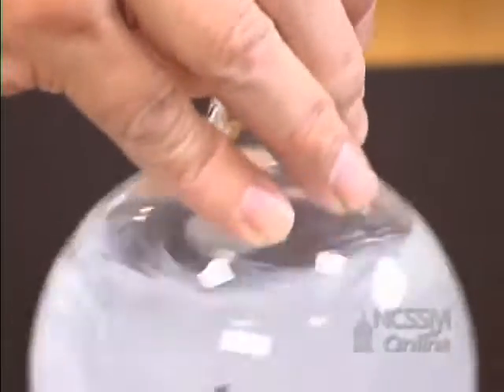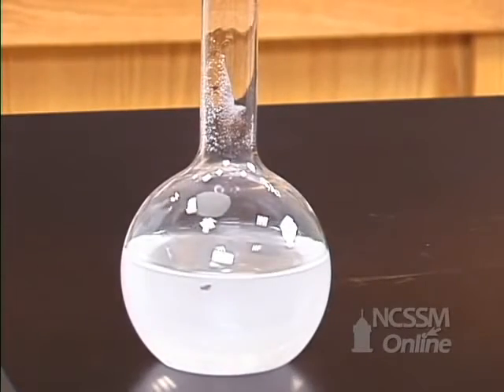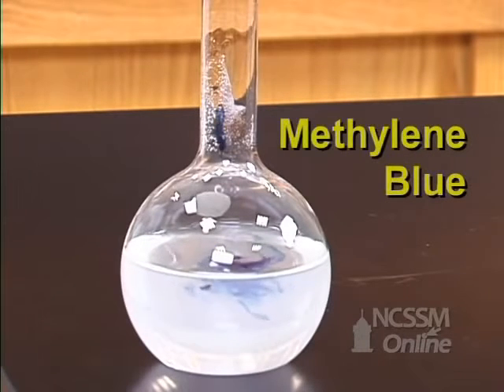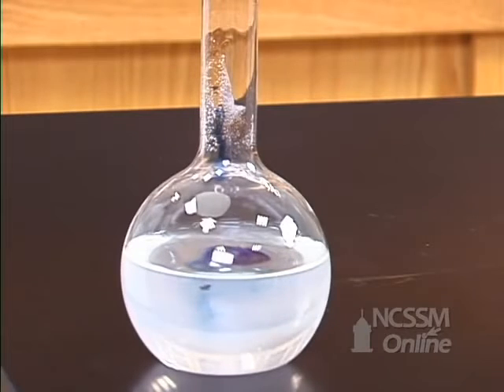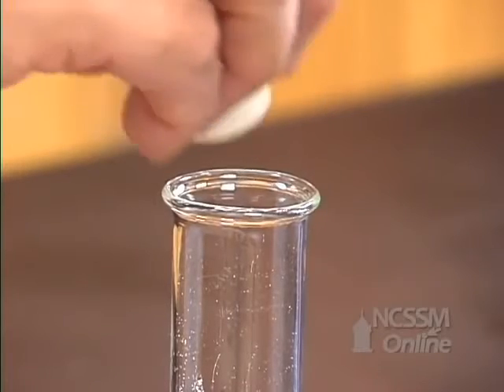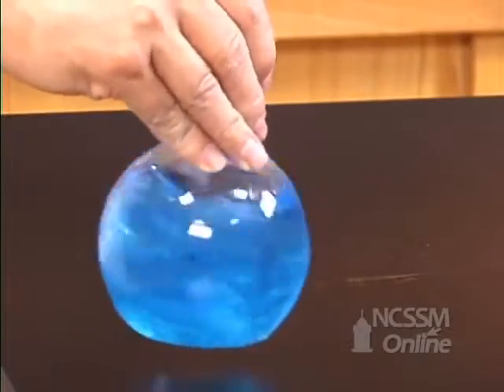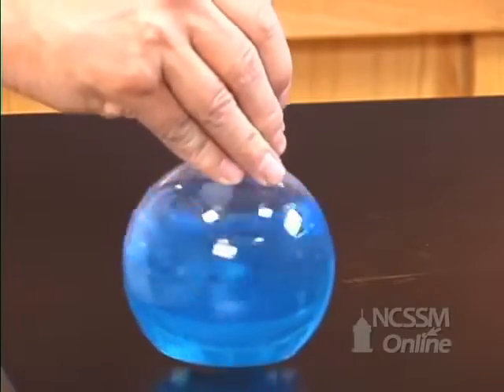I'm going to add a few drops of an indicator called methylene blue. Methylene blue is blue in the presence of oxygen and is colorless in the absence of oxygen. I'm going to swirl the flask and let it stand for a few minutes.